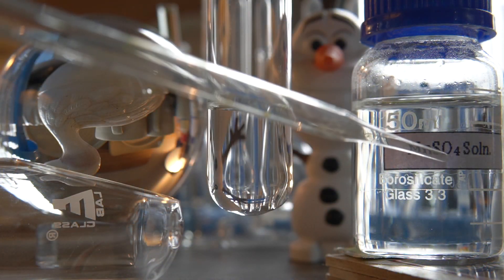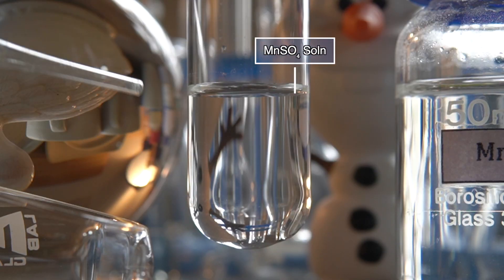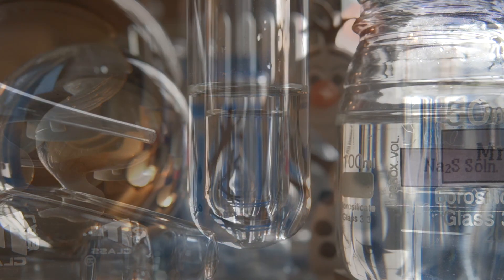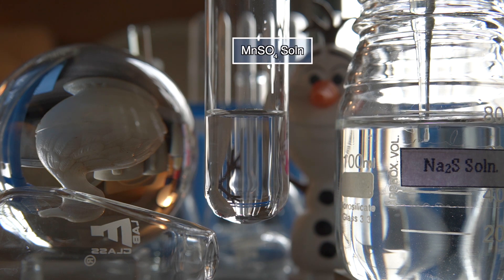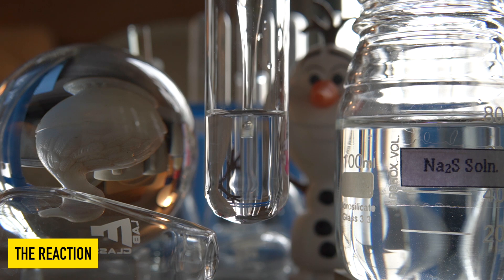Now to initiate the chemical reaction, we will take some amount of manganese sulfate into this test tube. Now we will add clear Na2S solution into the manganese sulfate solution slowly and observe the effects.